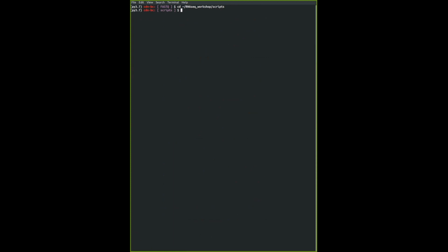For those who have moved your RNAseq workshop somewhere else, or saved it in other directories, you can stick to wherever the RNAseq workshop folder is. But just make sure that in this script and when we perform any other operations, you know exactly the directory to this folder before running the script and everything, right? Alternatively, just copy that folder RNAseq workshop into your home, and that will be much easier for now.